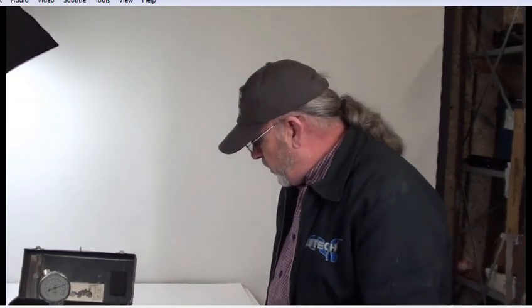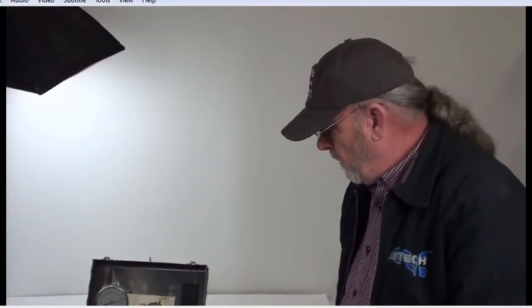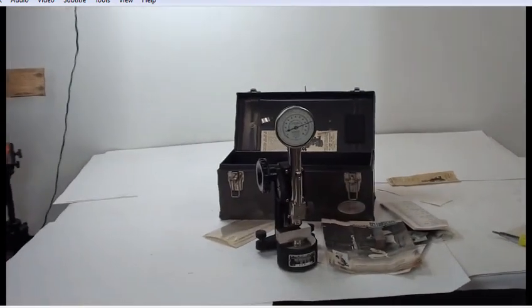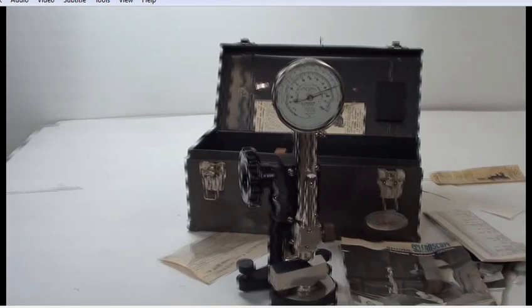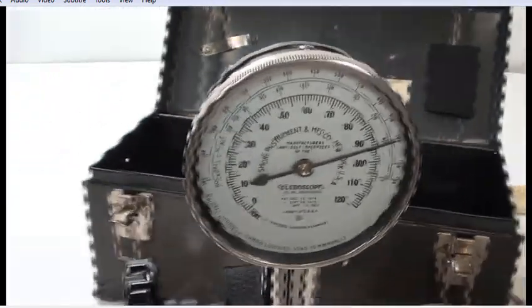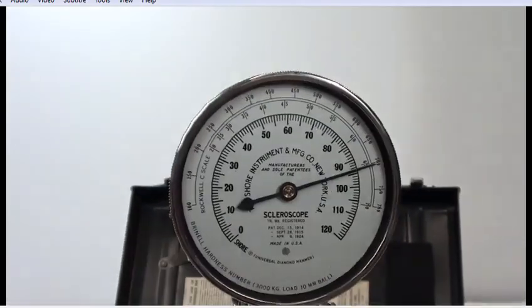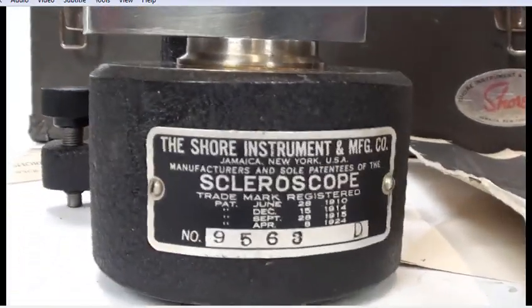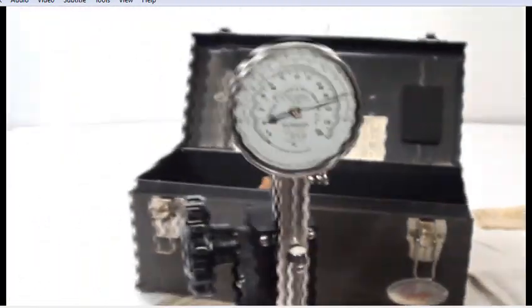Today we have a Shore Instrument and Manufacturing. This is a vintage scleroscope. It is a hardness tester with a dial indicator, and what we're going to show you today is how to reset the actual machine.